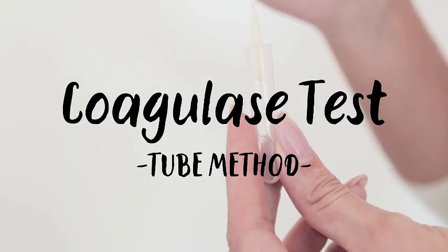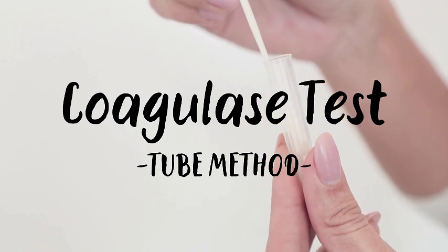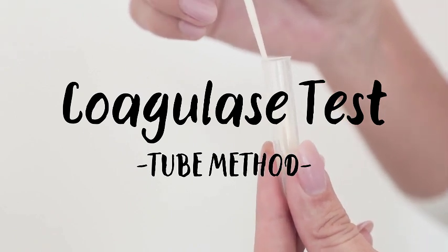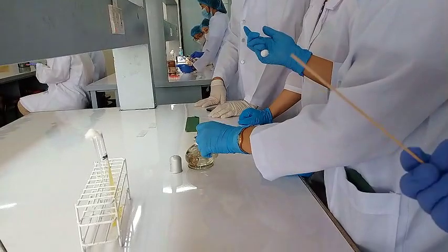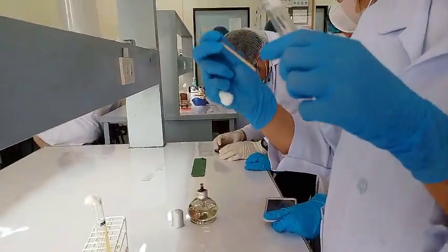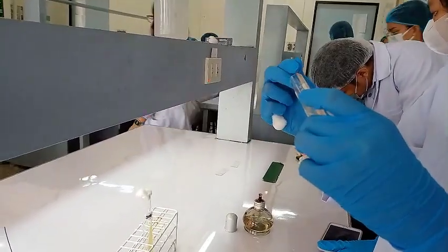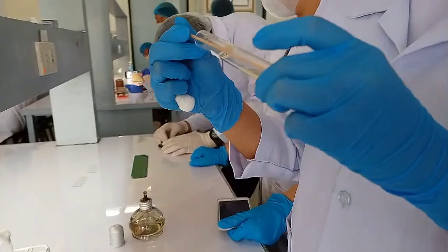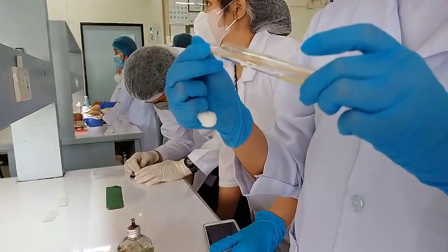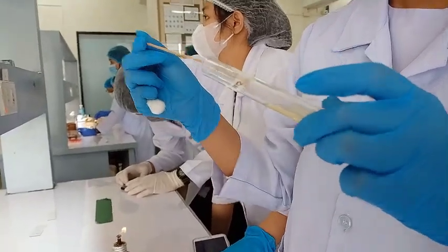The coagulase test tube method detects free coagulase, while the slide method in the previous experiment detects bound coagulase, or the clumping factor. So in this test, we are going to confirm the results of the slide method, because the slide method is a screening for the presence of coagulase.